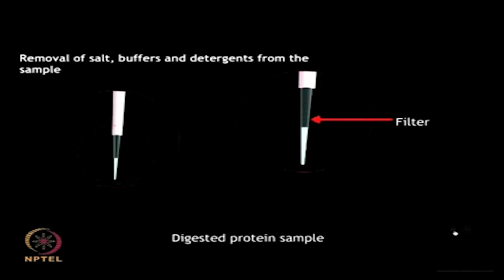It offers several advantages such as quick purification, sample enrichment and ensures that there is no contamination. So, there are multiple advantages of using zip tips.